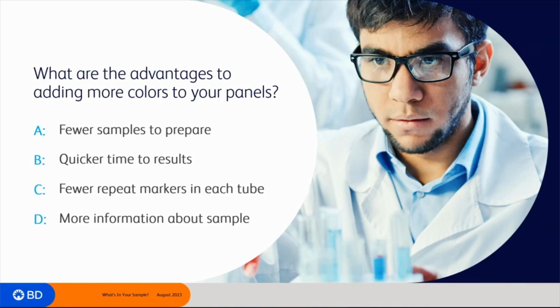Or another advantage could be shorter time to results because you would have fewer tubes to analyze, or it could be having fewer redundant markers in each tube, and that in turn saves money. Or it could be more comprehensive information about the sample. The answer is all of these are the advantages of adding more color to your panels.